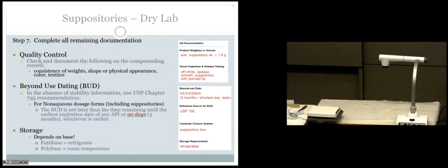And then you do have to describe the shape. So in this case, we could call it a pointed tip. This mold also has kind of a bullet shape, because it has a pointed tip. There are special rectal suppositories with the brand name Rectal Rockets. Why does the shape of the suppository matter, especially for a rectal suppository? Because you want to push it in. What do you want it to do when you push it in? You want it to stay there. So they're shaped to help minimize the chance for it to be ejected. So again, the shape is somewhat important, and sometimes you choose a mold specifically for that shape. Okay. So anyway, some description about the shape of the suppository.